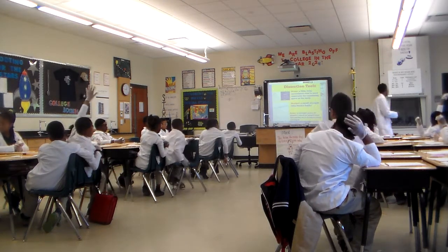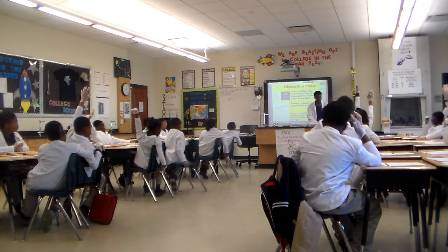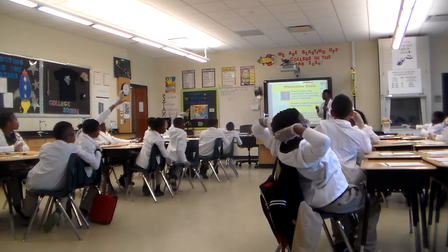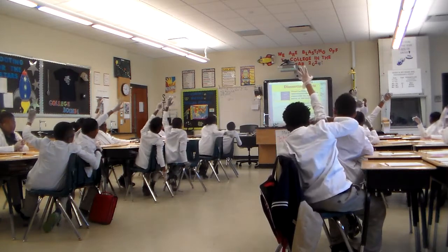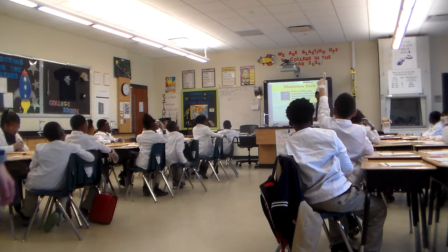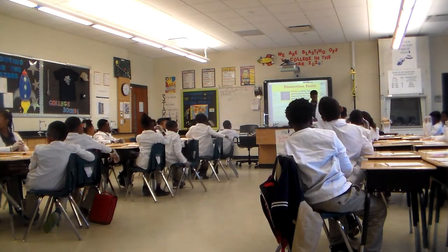Take a look at our next scientific tool. This one is a little bit less dangerous. Pate, what is it, sweetheart? Yeah, a ruler. Who can tell me, what do we use a ruler for, right? Pretty straightforward and simple, Donald. Yeah, to measure things. There's going to be parts of your specimen, parts of the heart, that you're going to want to measure, right? You're going to be able to use this ruler in order to do so.